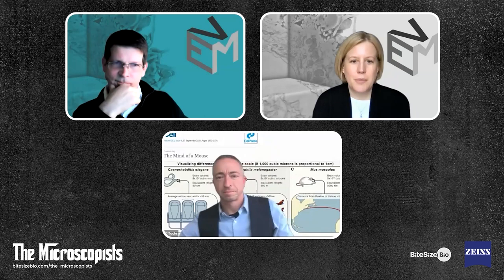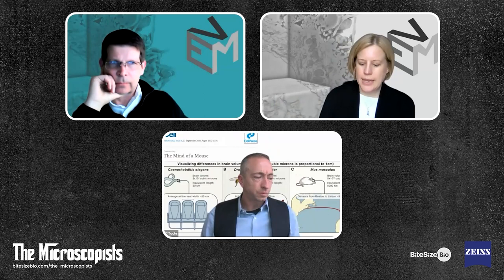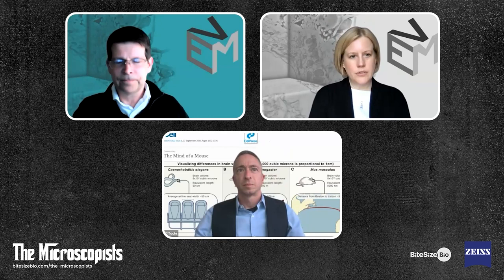And if the challenge of mapping the mind of the worm was the width of one airline seat, then the challenge of mapping the mind of the fly is the size of 6.5 Boeing 747 airliners. And by the time you get to the mouse, then you're talking about the distance from Boston to Lisbon. So the scale increase in challenge across the entire pipeline in sample preparation, in imaging speed and imaging volumes, and then in data analysis is almost unimaginable at the moment. And the effort to get to the mouse brain will deliver us the next generation of imaging technology.